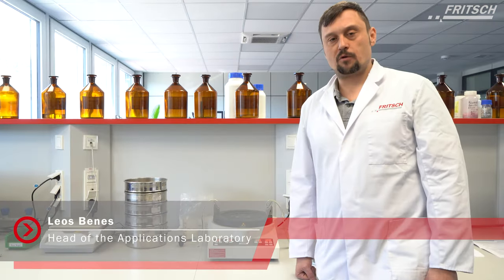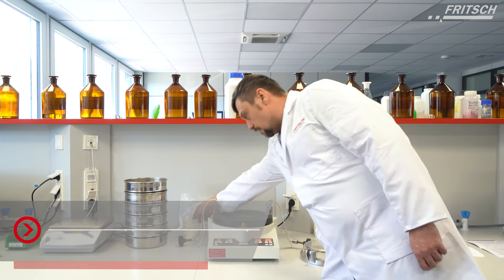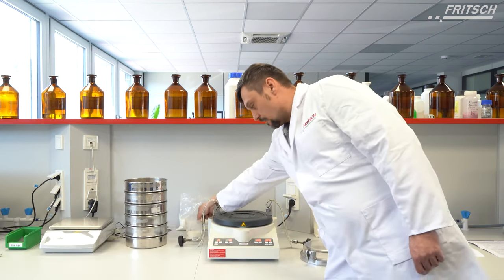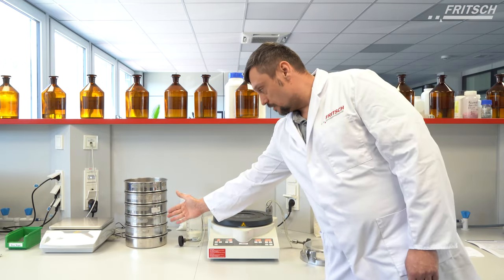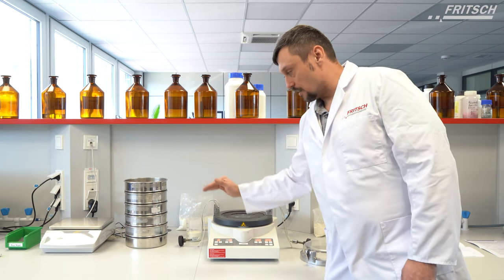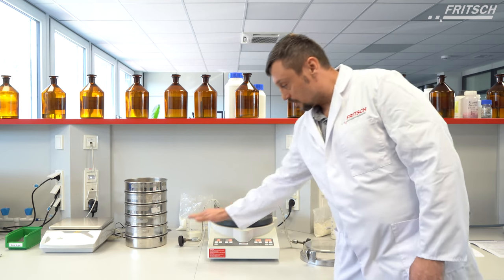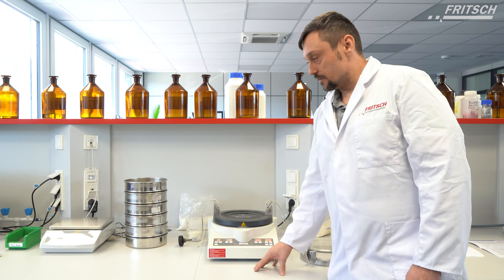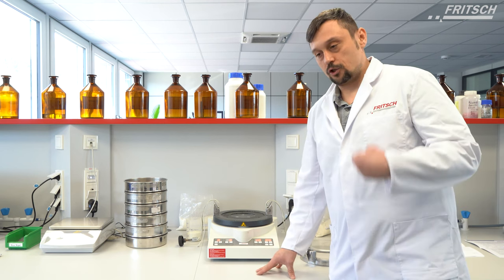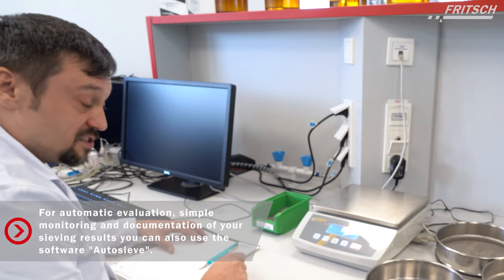This is a short video about a sieving application of a typical flour sample with an NLZ3. We have several sieves for separating the sample, and what we want to do is use the NLZ3 to separate this sample into fractions and analyze it afterwards by checking the masses of each sieve.